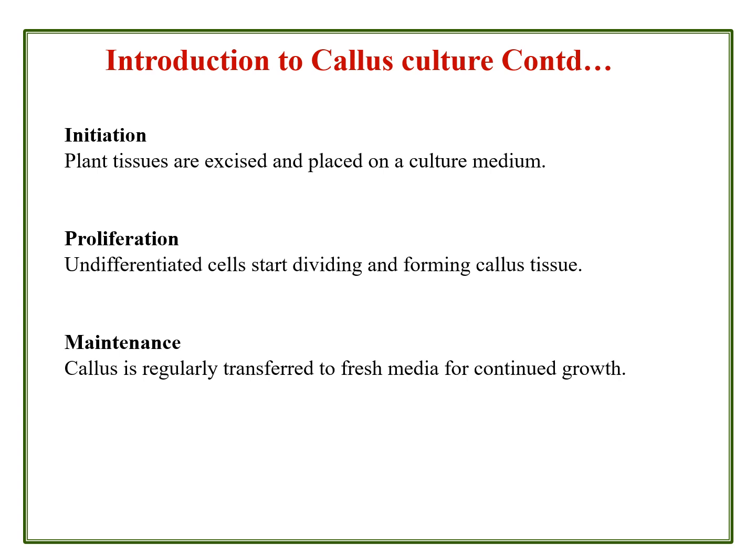If they are maintained on the same medium, that is MS medium supplemented with the auxin-rich and cytokinin-less concentration you designed previously, all the nutrients are completely absorbed by the existing callus cells or inoculated callus cells.